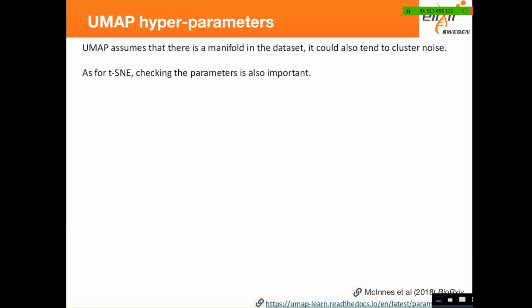And I'll come actually to that, to the Fourier transformation of the tSNE, which is as fast as UMAP. So it doesn't really matter which one you choose, because in many cases you'll get kind of similar results, especially if you tune the tSNE to have also the global embedding. So they will be quite similar in the end as well.